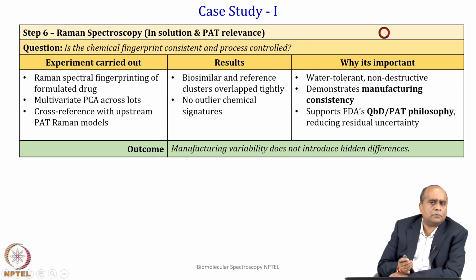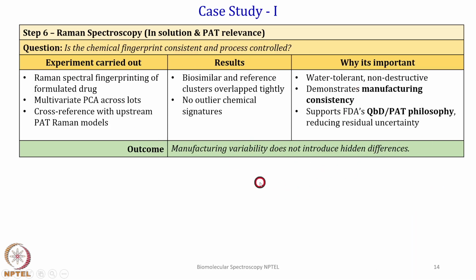It is water tolerant and non-destructive, and it demonstrates manufacturing consistency. The FDA is now recommending a quality by design or PAT philosophy, so that you reduce the uncertainty of your drug product production, right. So, manufacturing variability does not introduce hidden differences; that is why you are doing continuous monitoring using Raman spectroscopy. So, one can now combine each of these techniques, UV visible, CD, fluorescence, FTIR, Raman, in developing a robust protocol for your drug manufacturing in the biopharma industry.